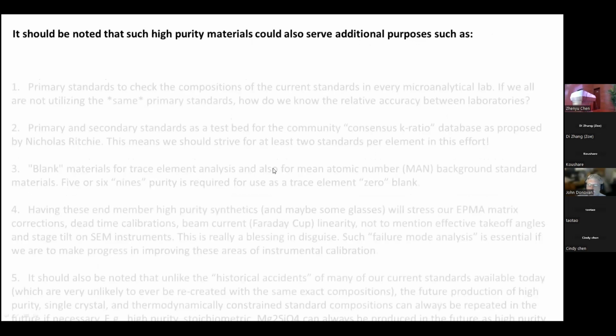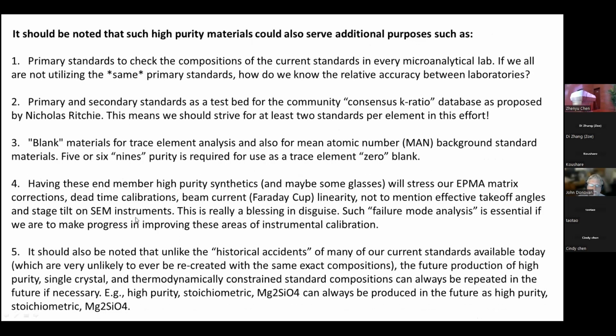Okay, so we can also use these synthetic standards for lots of other purposes. I'm not going to go over this again, but these would be wonderful standards for all sorts of tests, and not just as primary standards or secondary standards, but for other kinds of measurements.